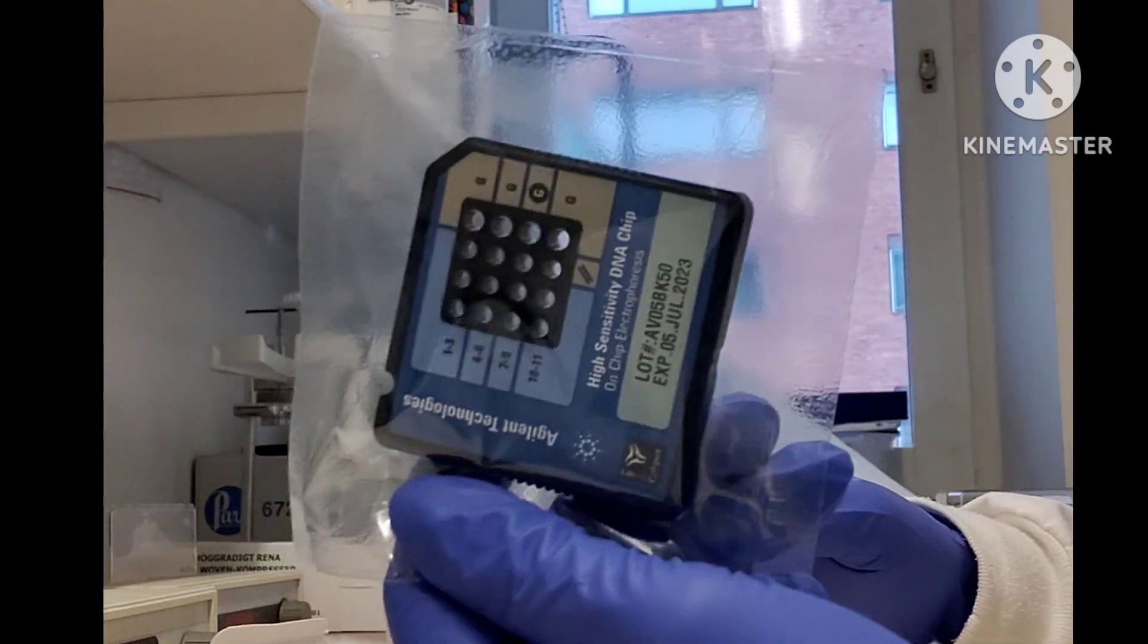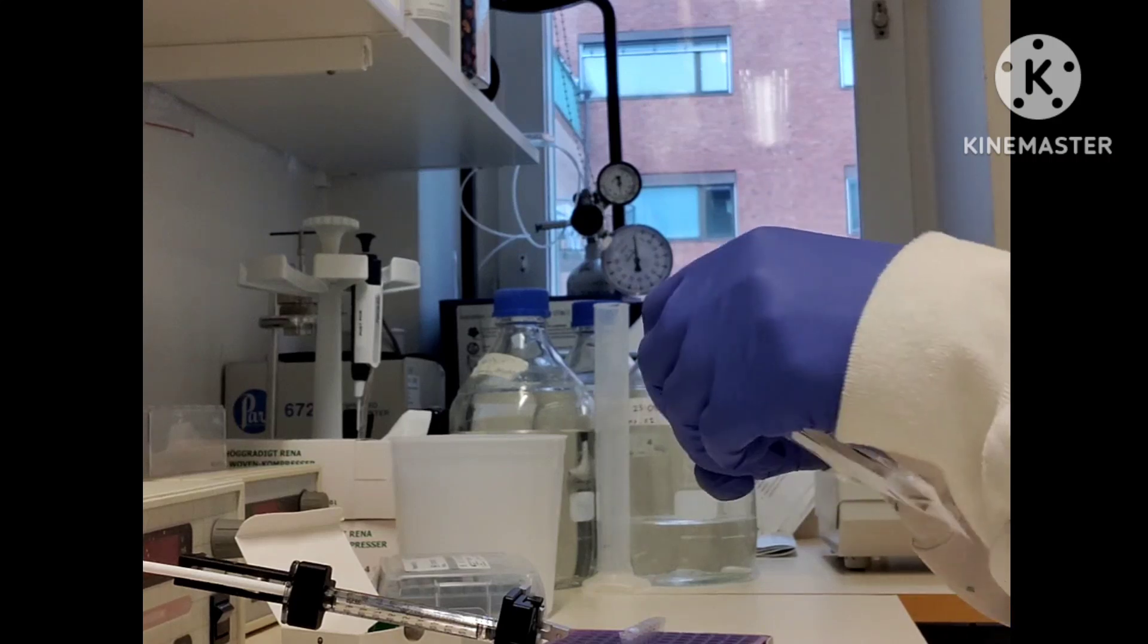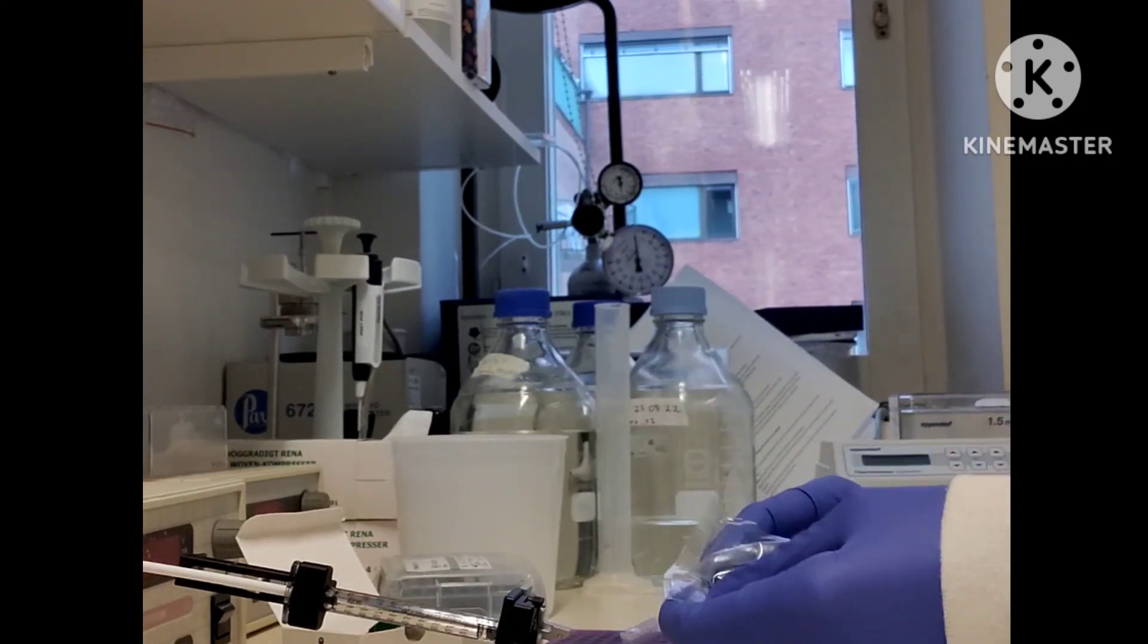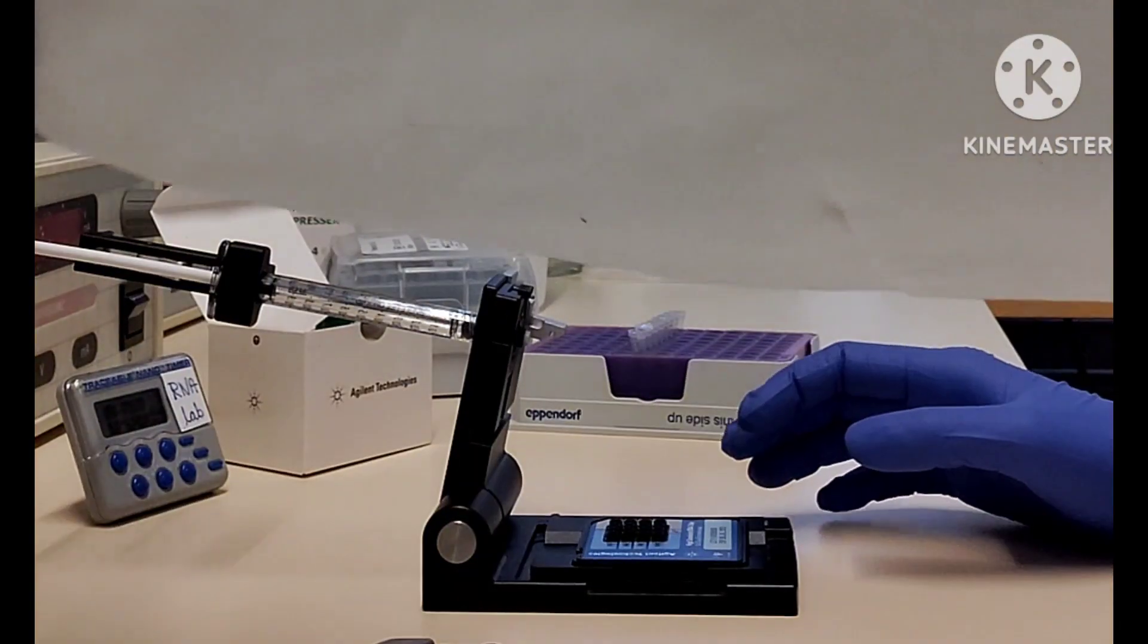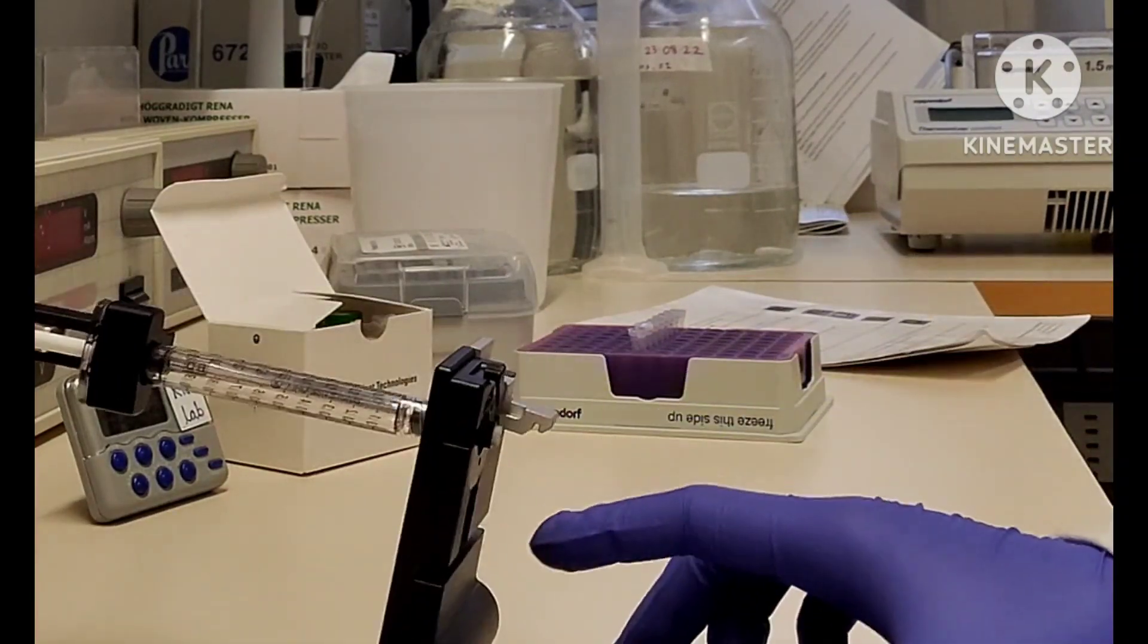This is the chip where I will load my sample and do the assay. If you see the back, you can actually see the connections between each well. I tried to show you that, but it's not possible in the video, so you can check it out on your own. I will just take them out and place the chip on the priming station.